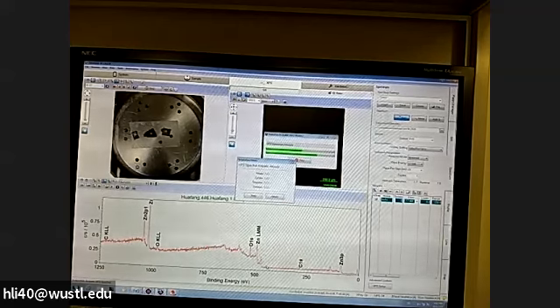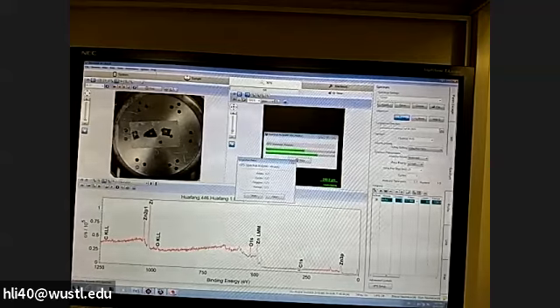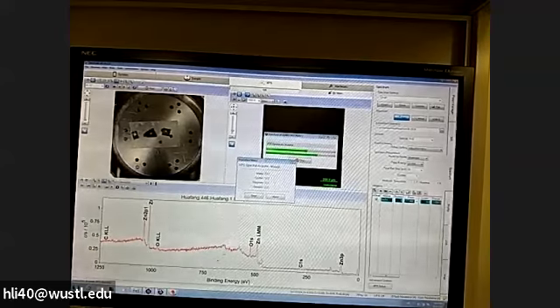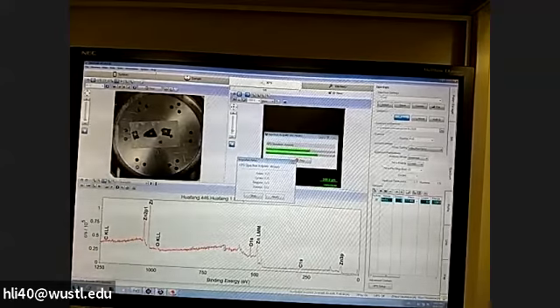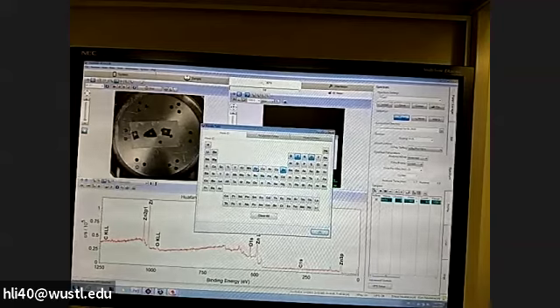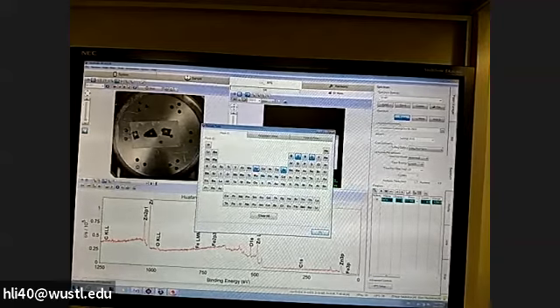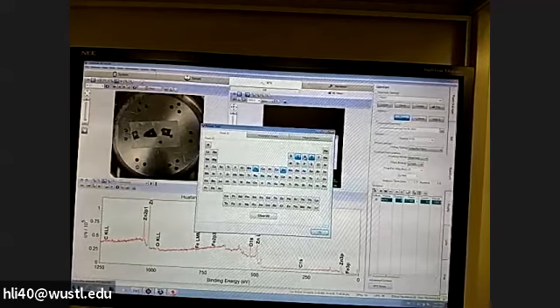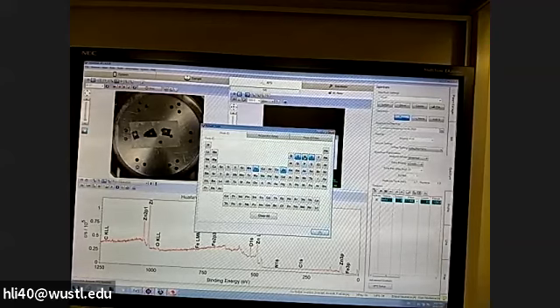Yeah, this is all zinc oxide, with a little bit of carbon. Some people are also interested in iron, which is about 600 something. You can click the element table here and ask where the iron is. Almost no iron. Where's nitrogen? Nitrogen should be around 400. So no nitrogen.